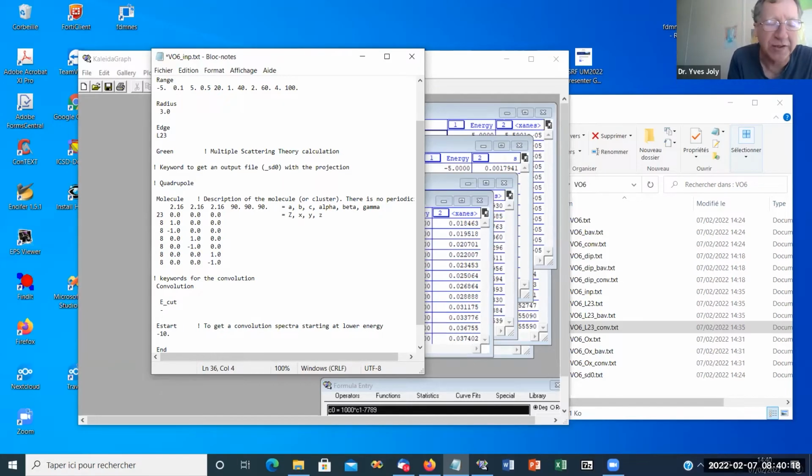It must be close to 0 in any case, but you can try minus 0.5 or things like that. Sometimes it can be slightly positive also, but it must be close to 0. When you make simulations, you can check the pre-edge, comparing to experiment, to see if this improves, if a pre-edge appears that you can see in the experiment but not in the simulation, at lower energy. Especially if you work on 3d materials, this can be helpful.